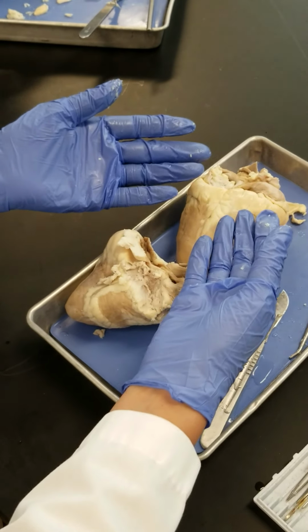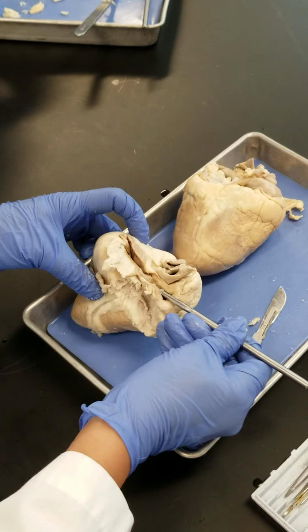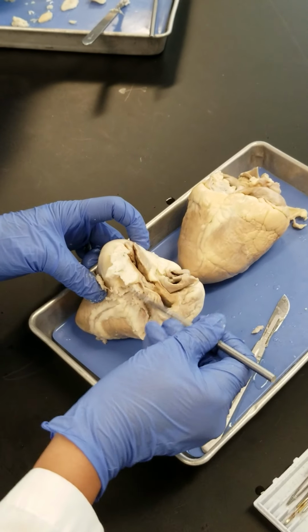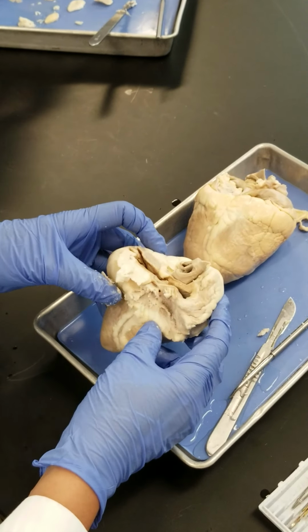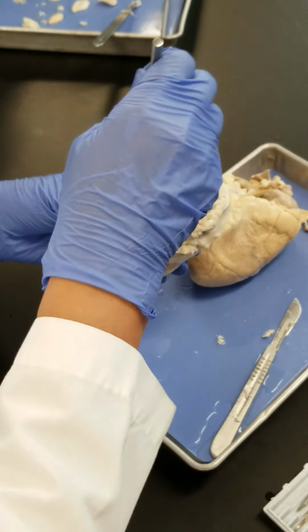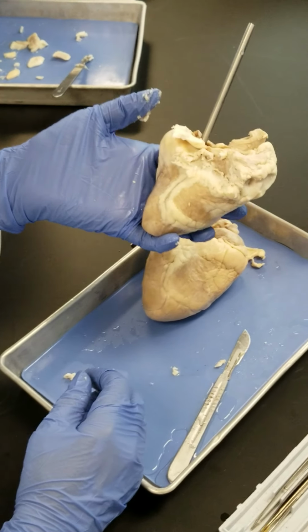And most of the time in these hearts, all have been cut. If you are very lucky, you see just an impression like the one that we saw here, right? We would see all those impressions here. If we are not that lucky, you just see a big hole that is the whole left atrium, right? But still, I may ask you which vessels are going into this chamber. You should use your knowledge and what you see.